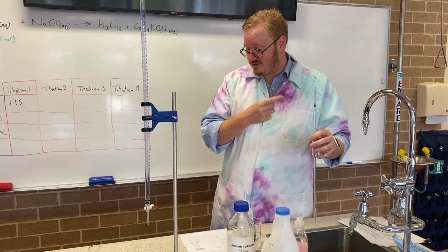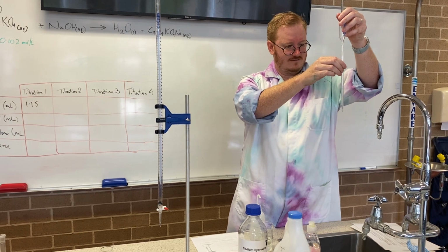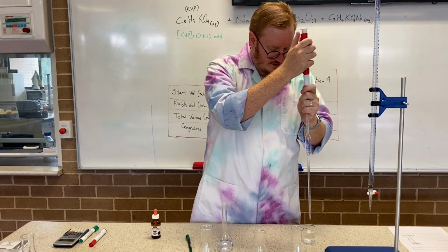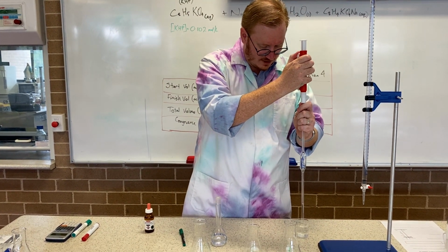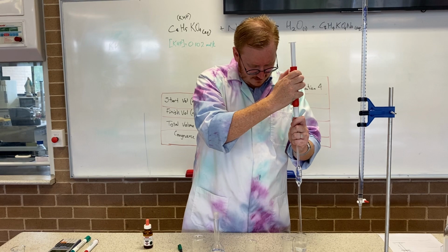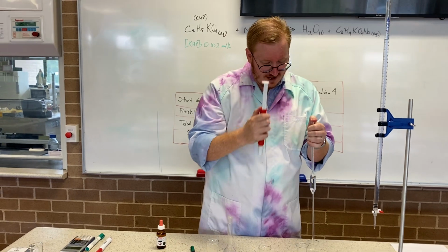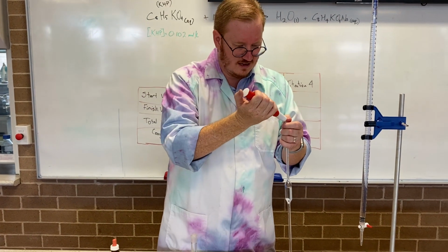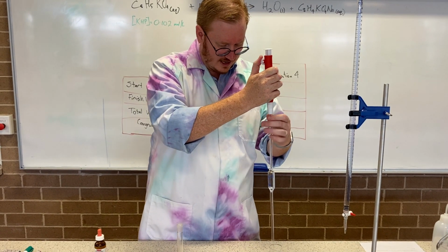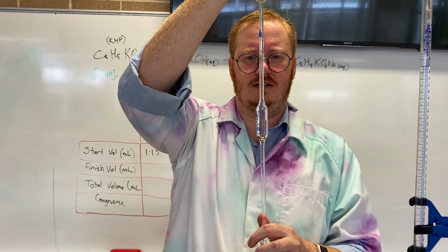Okay, now I'm ready to actually put 25 ml in there. Alright. Add it on. What I'm going to do is draw it above my calibration line. Because the trouble is, I'll show you what happens if I try to get the calibration line. If you ever reach the end and haven't got the full volume, put your finger on the end, push it back down, put it back on, start. Okay, I'll try to get it to the calibration line.